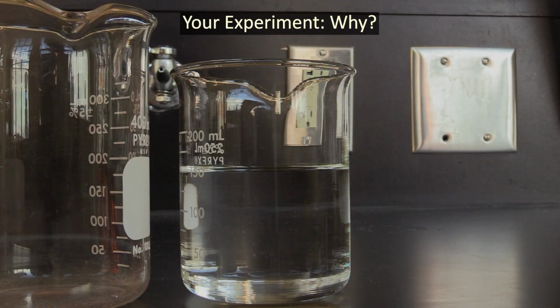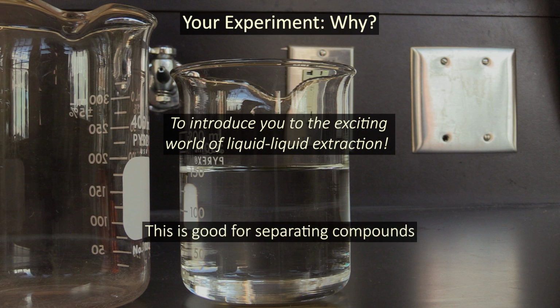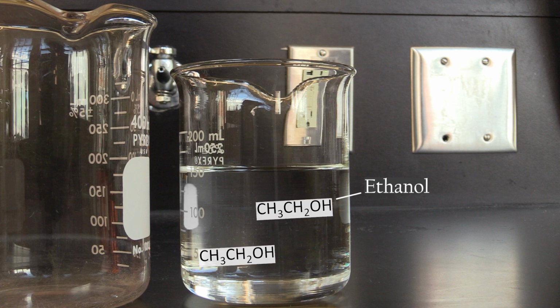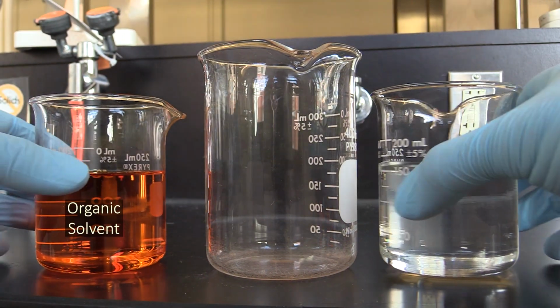Let's start with the point of this lab. This experiment will introduce you to liquid-liquid extraction, which is a technique you can use to separate two or more compounds based on their solubilities. Here's how it works. Let's say you had an aqueous solution of ethanol that was contaminated with benzene and you wanted to get the benzene out of it. To do this, you could mix your solution together with some organic solvent.